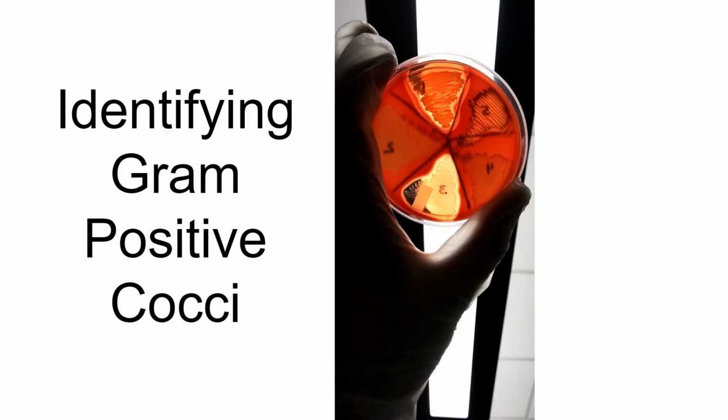Let's get started. Imagine you were in a lab and you held up this agar plate. You have 5 unknown bacteria on there, and you have no idea which is which. How would you determine which bacteria is which on the plate? Also, why would you want to know what genus and species you have in the first place?